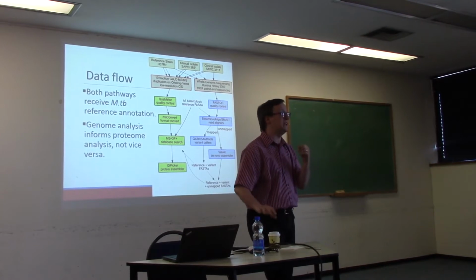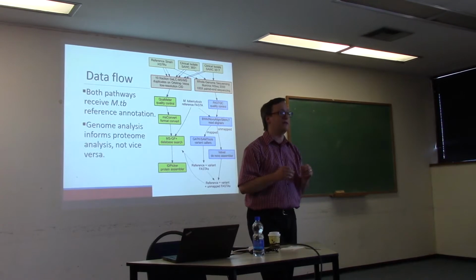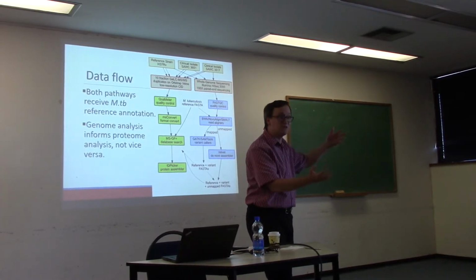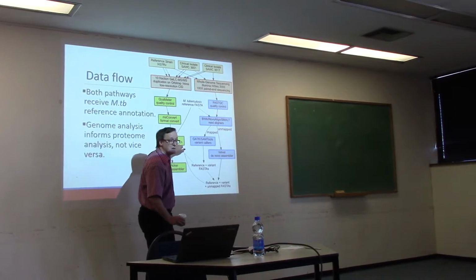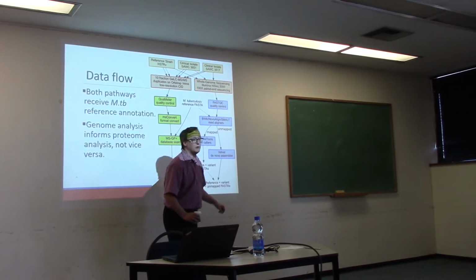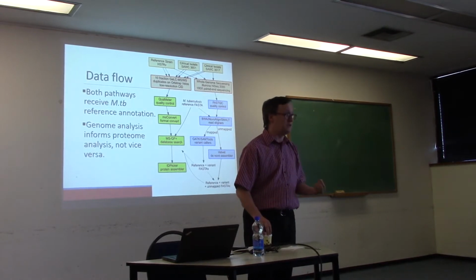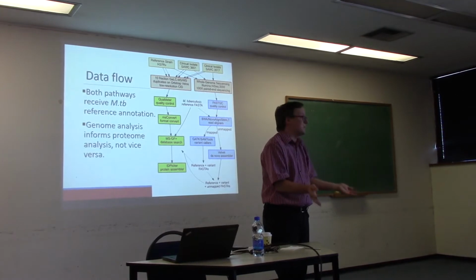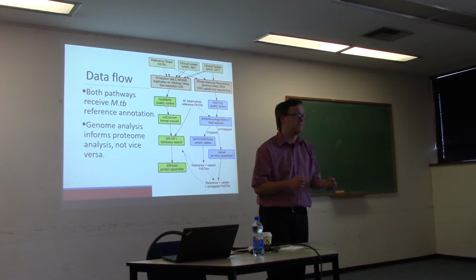So we were able to see places where, for example, a leucine in the standard H37Rv had become a valine in these 2 lamb strains. But each of the lamb strains had their own peculiarities. So we were able to create a sequence variant FASTA sequence database as well. And finally, we were able to stick on a whole bunch of added sequences that were found in these unmapped regions. Because these unmapped regions may contain all kinds of stuff that ends up getting expressed. And if we could confirm that any of that were expressed, we would feel really good about it.